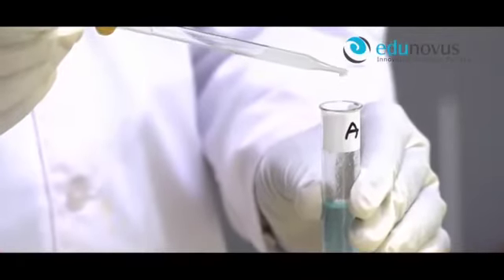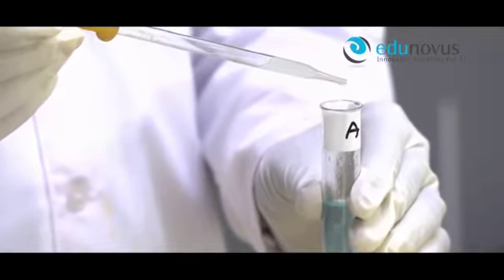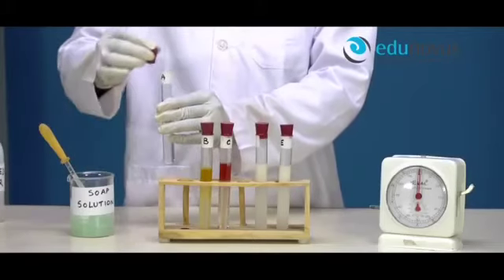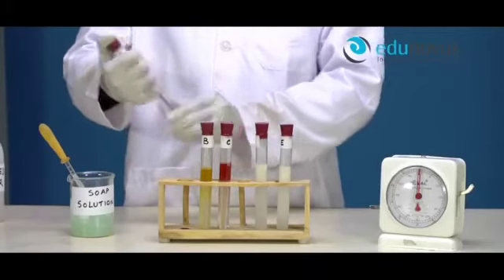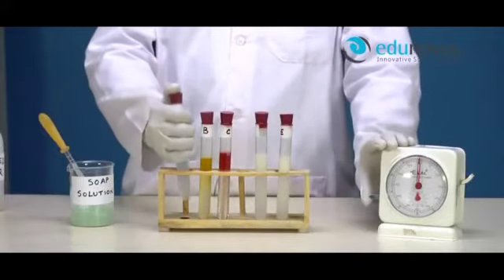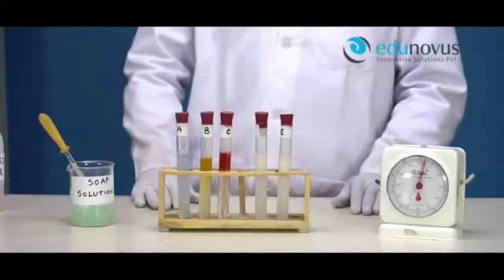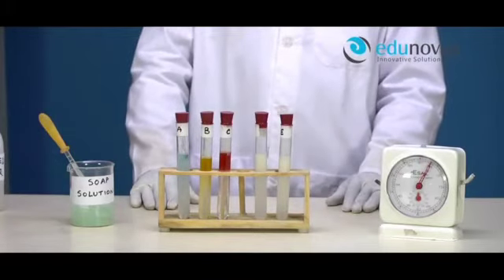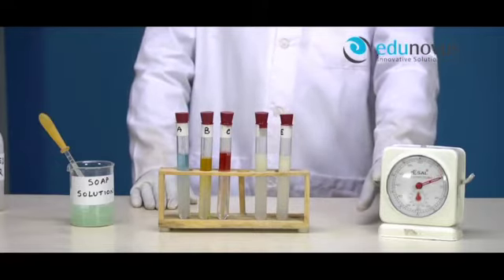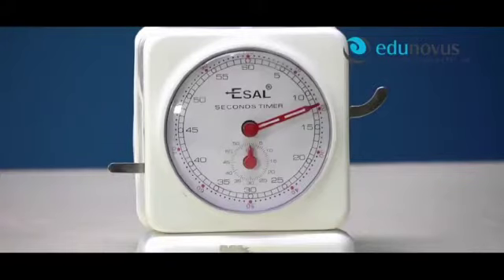Now add 10 drops of soap solution to the test tube A. Shake it vigorously again for a minute and then allow it to stand. Note down the time taken for layers in the test tube to separate out. Here you can clearly see the time taken by test tube A is 12 seconds.